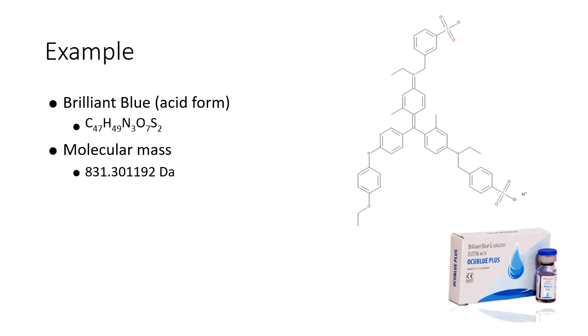When you're trying to assign formulae to peaks in mass spectra, many of the steps require you to be working with the masses of neutral molecules rather than ions. So this means you need to modify the mass of the peak in the spectrum by the mass associated with however it's been ionized. If the molecule was protonated to create the ion, then you'll have to remove the mass of the added proton before trying to assign the formula. Alternatively, if the ion was formed by deprotonation, then you need to add the mass of that proton back onto the peak mass to predict the original molecular mass.